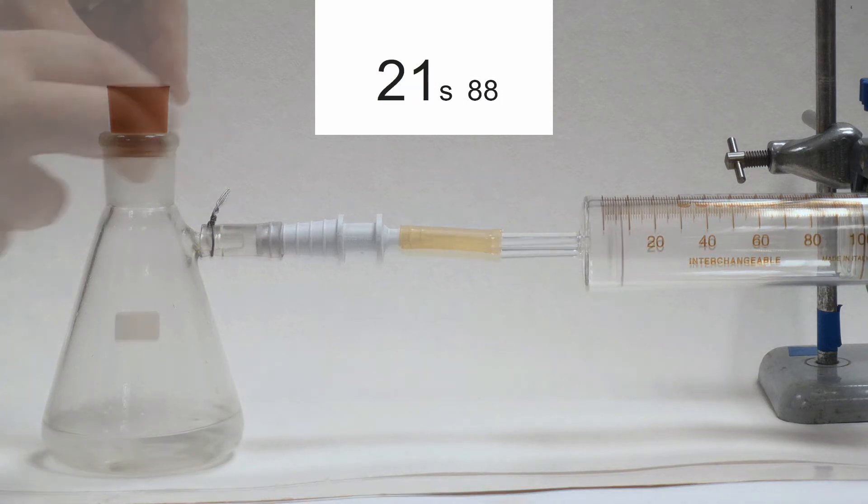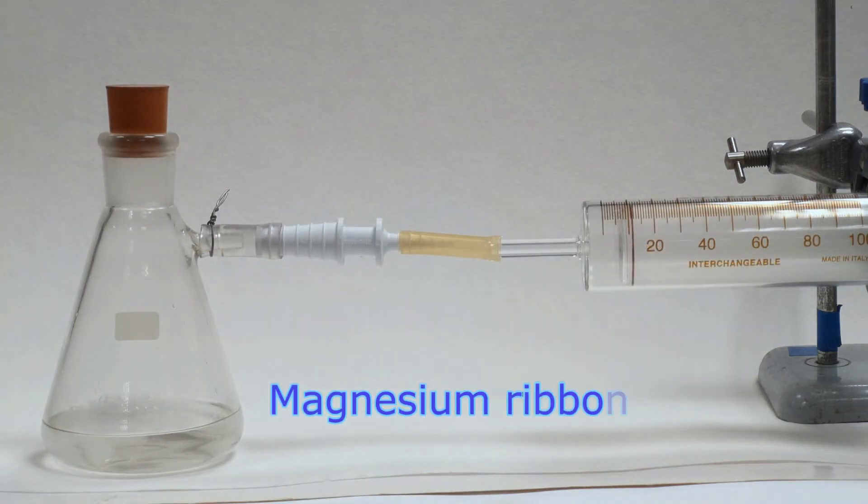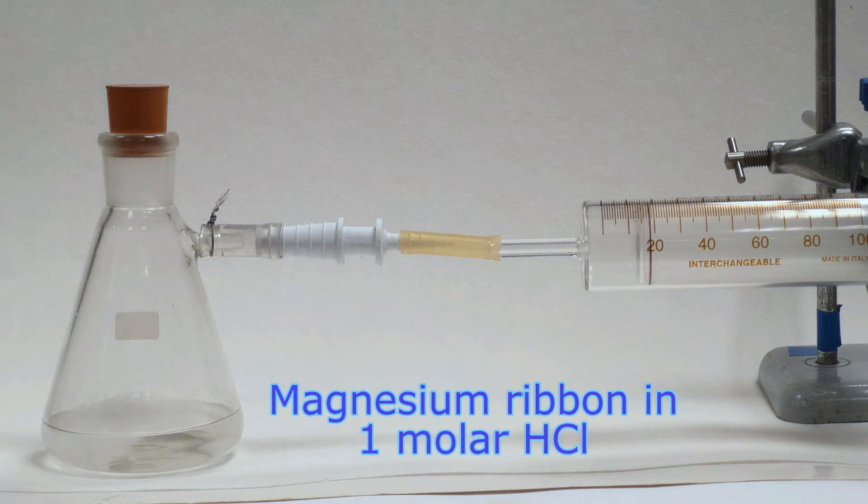With this 2 molar acid, you can see it takes about 17 seconds to produce 80 cubic centimetres of gas.